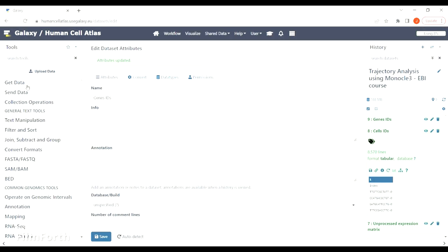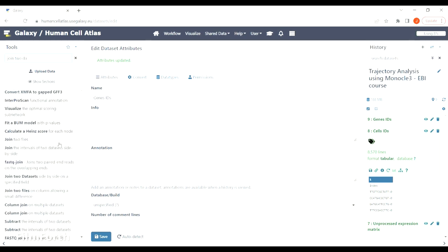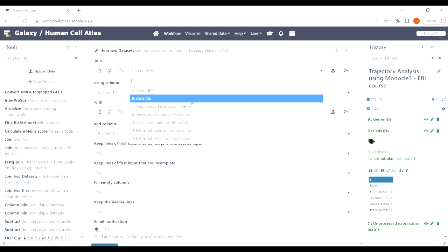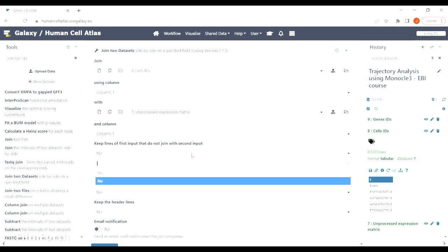We will now perform a series of steps to modify the unprocessed matrix by using genes and cells IDs from the files we've already prepared. We can now compare them to columns and rows in our unprocessed matrix and select only those that correspond to each other.